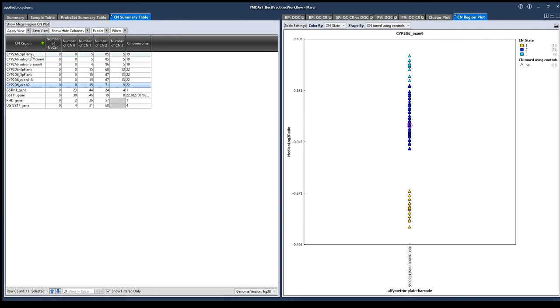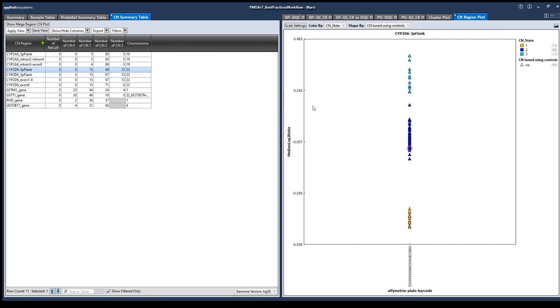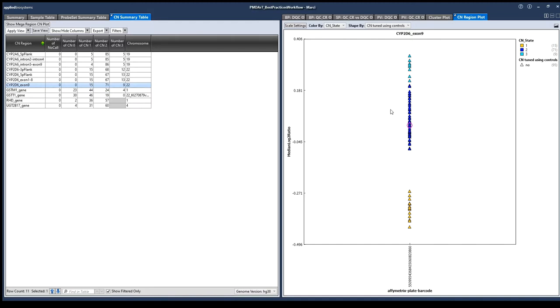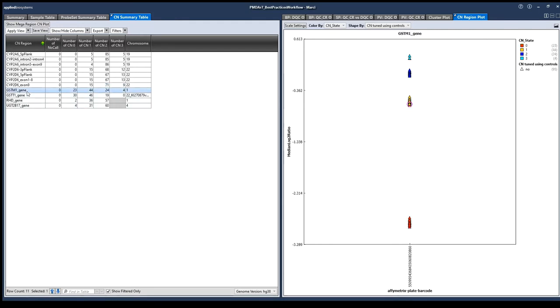Copy number states that cannot be reported by the software are displayed as empty with a gray background, as we see here in the copy number 3 column for the RHD gene and the UGT v17 gene. As I click on a row for each copy number region, the corresponding CN region plot gets displayed on the right. Here we can see which samples have a copy number state of 0, 1, 2, or 3. For example, looking at the GSTM1 gene, we have samples representing each of these copy number states — for example, 23 samples shown in red that have a copy number state of 0.